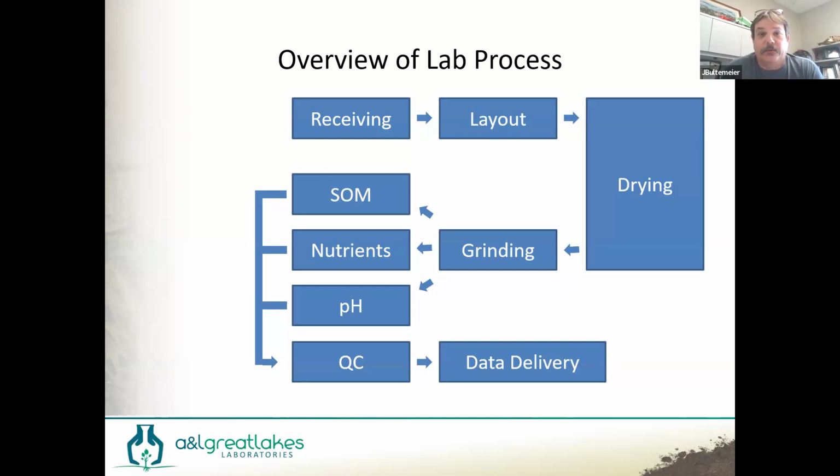Seems pretty simple until we get into our busy soil season and we start laying out 15, 16,000 samples a day. So it can be quite a project. But the goal is to get all those samples laid out so that we know which tests they are, we have them grouped together, and then we can start entering the information about them into the database. We want to try to get as much correct as possible. If there's any concerns, maybe a customer didn't fill something out correctly, or we're not sure what they want and we need to ask some questions, we do all that in the layout process.